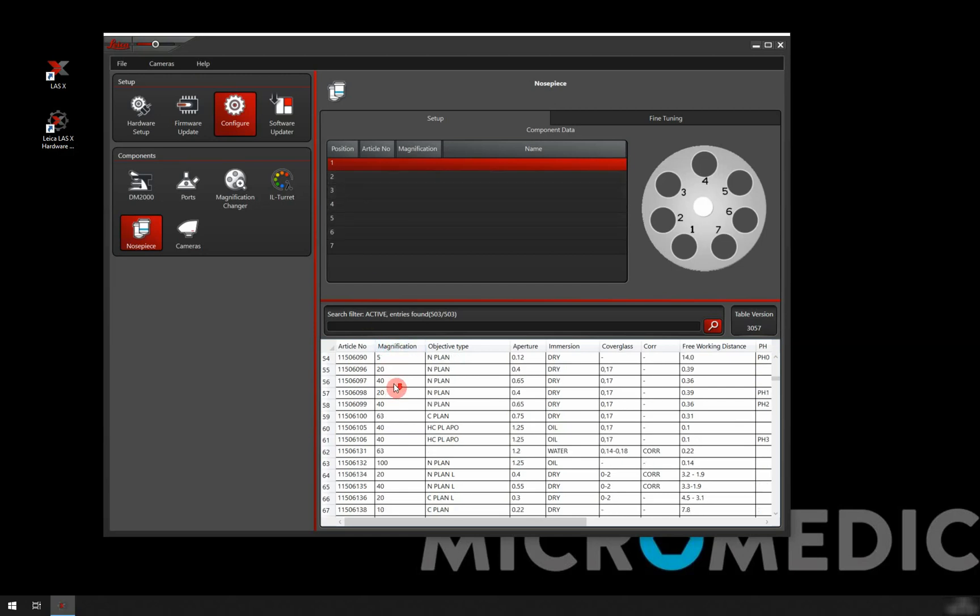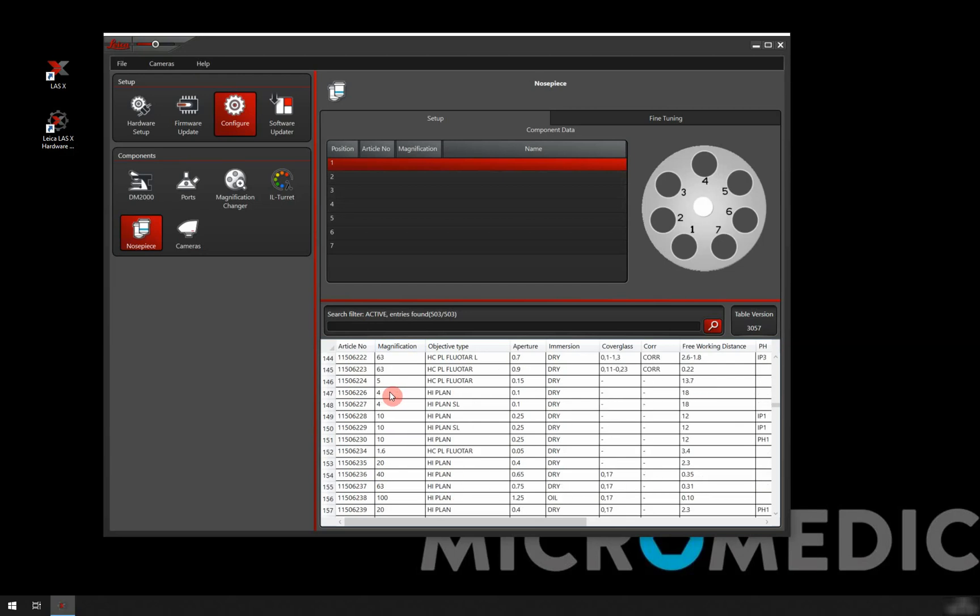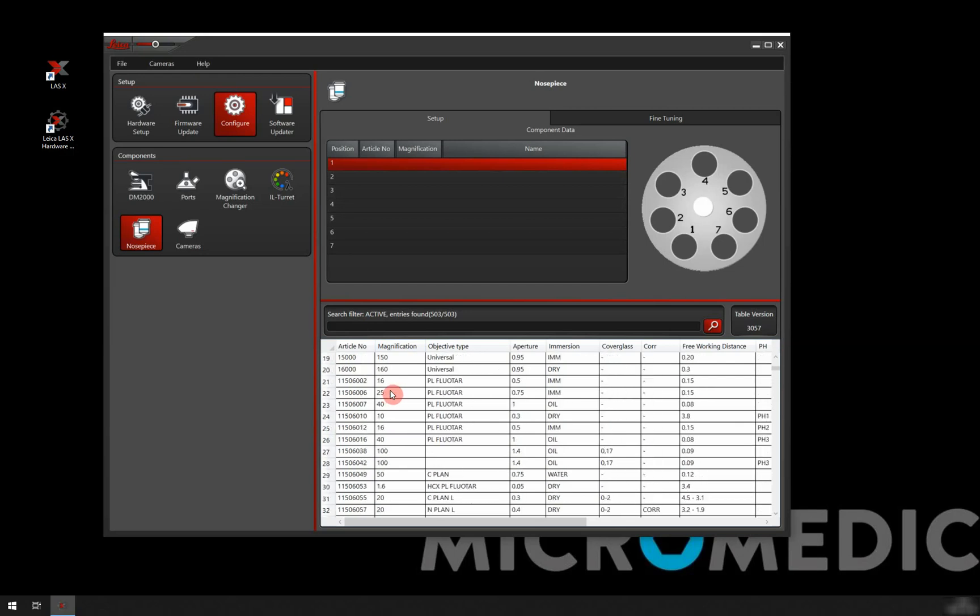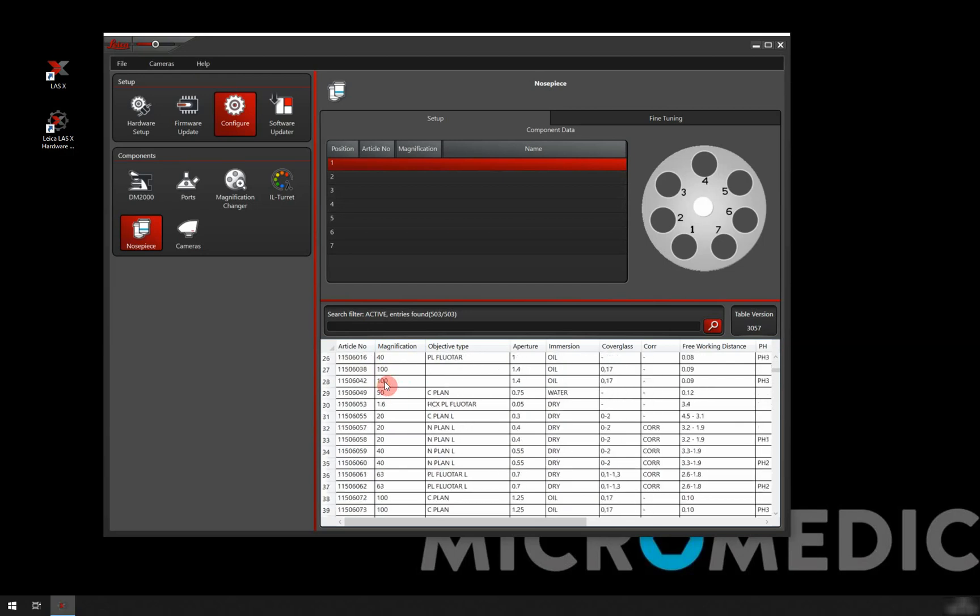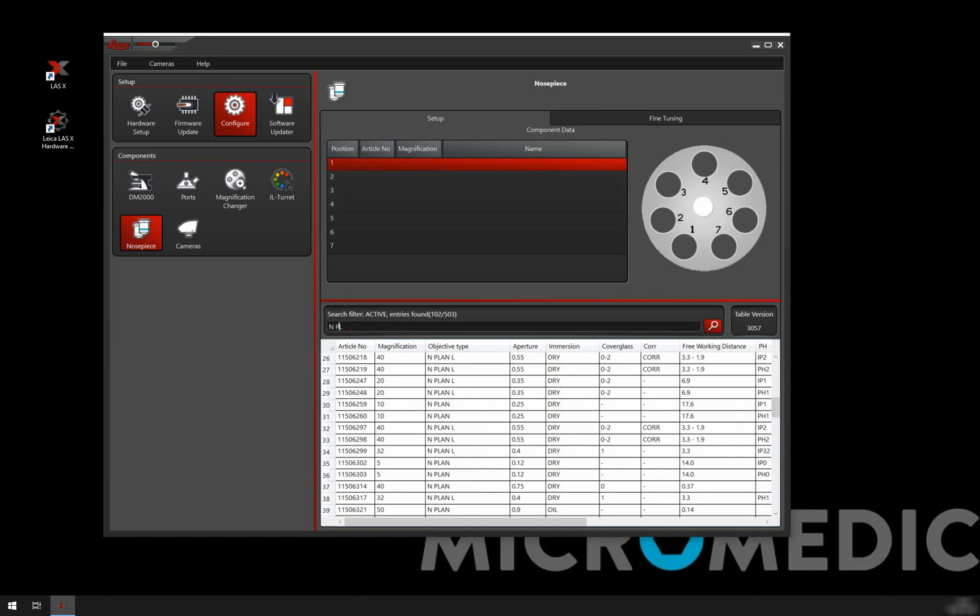Here we have a very long list with objectives. So the easiest thing here is to use the article number. But you can also search for other things. For example, if I know that I have N Plan objectives, I can search for that and I'm going to get all the objectives of N Plan.